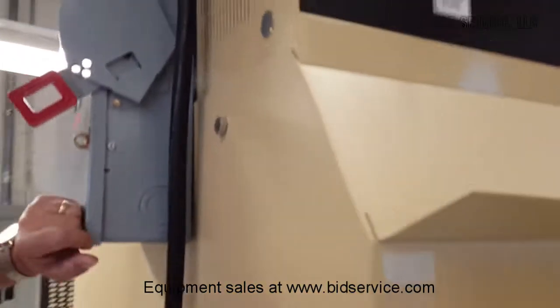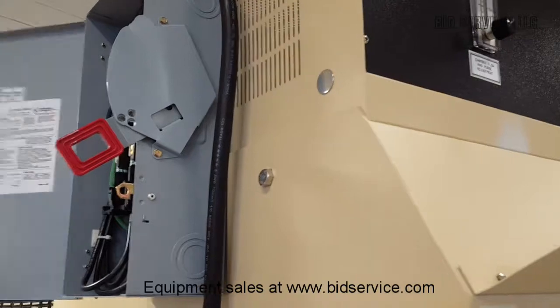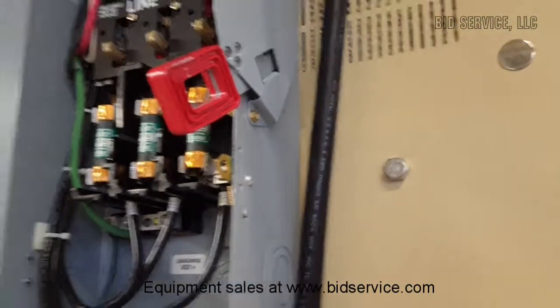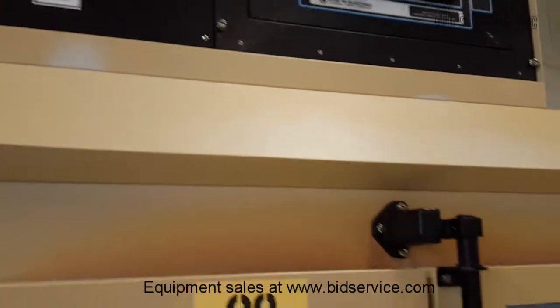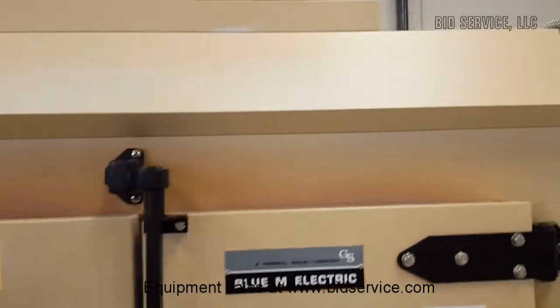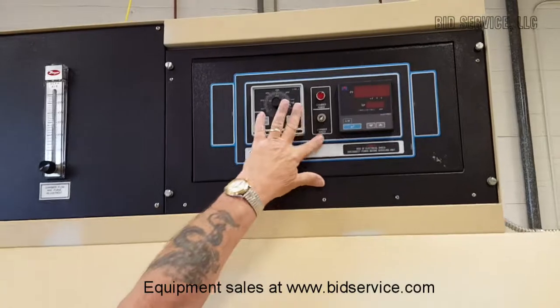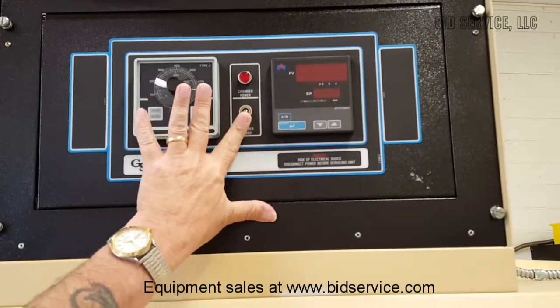It's powered by three-phase — three-phase 208. Once that power is applied, we hit the main power switch here. It says 'chamber power' but it is the power for the entire unit.